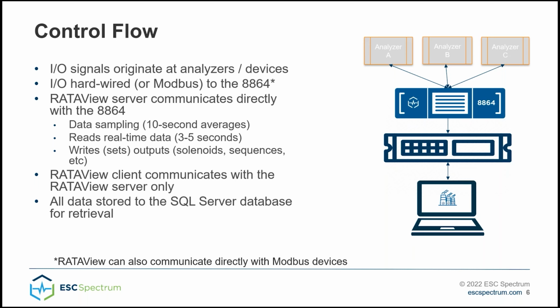The client itself can be run on a laptop or the server, but it only communicates with the services and the database on the server. And all the data is stored to the SQL Server Express database that's located on the server.